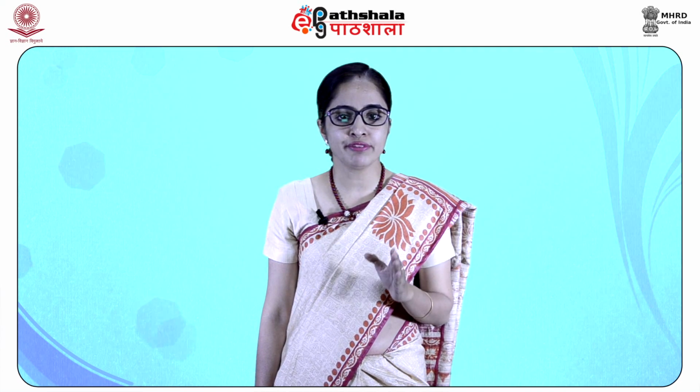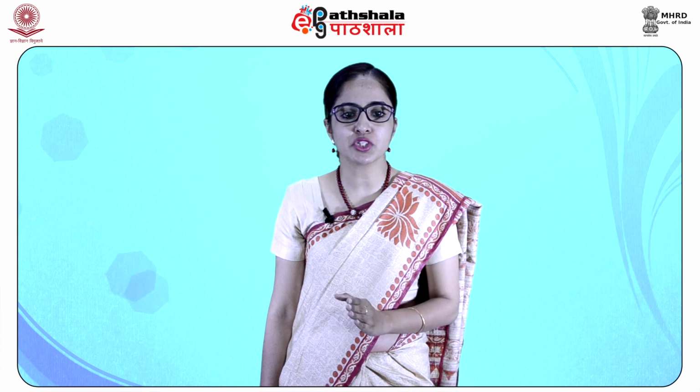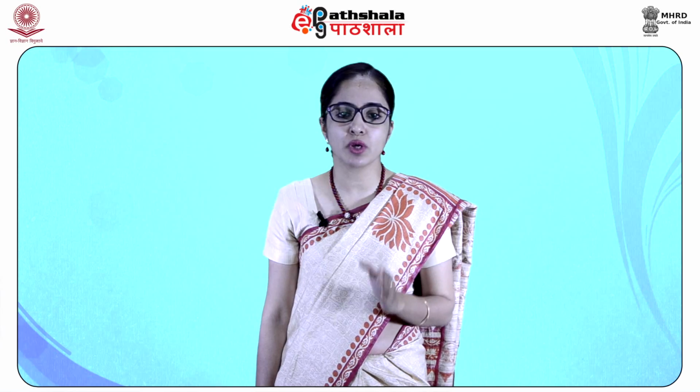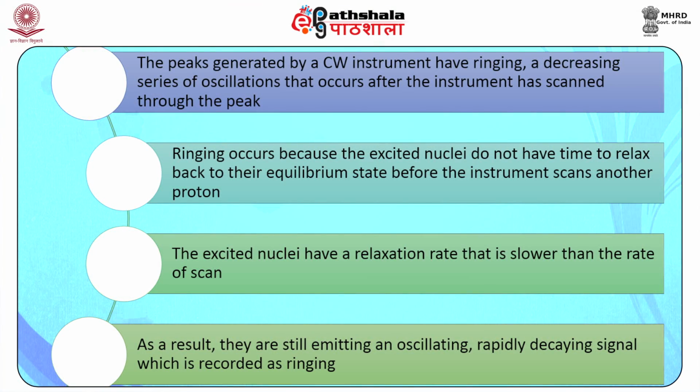Instruments which vary the magnetic field in a continuous manner, scanning from the downfield end to the upfield end of the spectrum, are known as continuous wave instruments. I hope now you can better appreciate the meaning of continuous wave instruments. The peaks generated by continuous wave instruments have a ringing, a decreasing series of oscillations that occurs after the instrument has scanned through the peak.